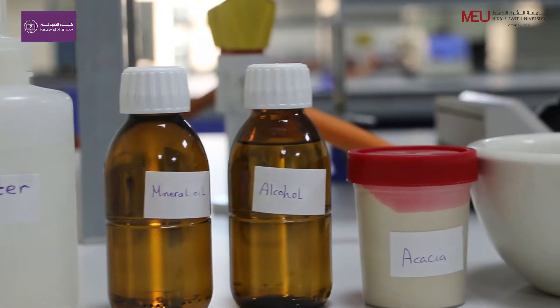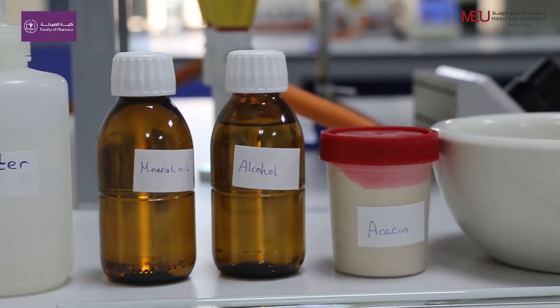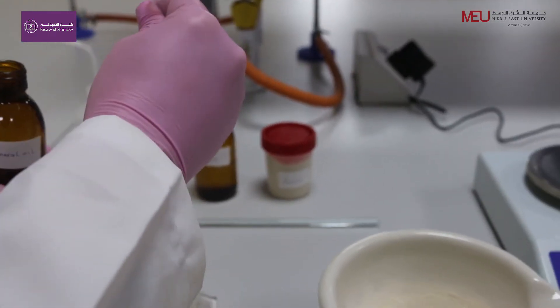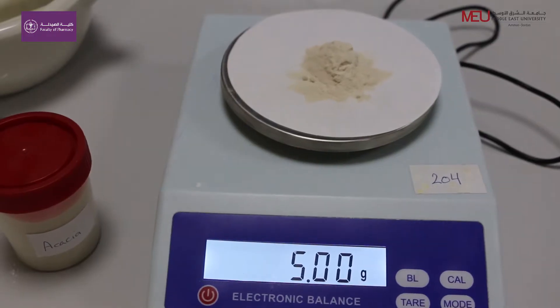How to prepare 30 ml mineral emulsion by dry gum method, which we use to treat constipation. Measure 15 ml of mineral oil and triturate with 5 grams of acacia in a dry mortar.